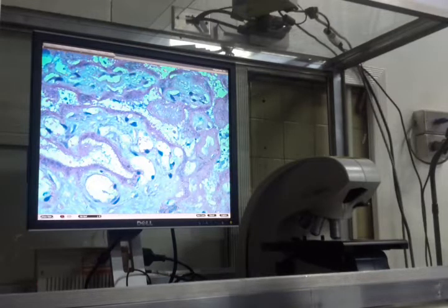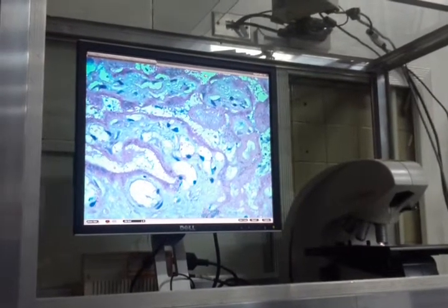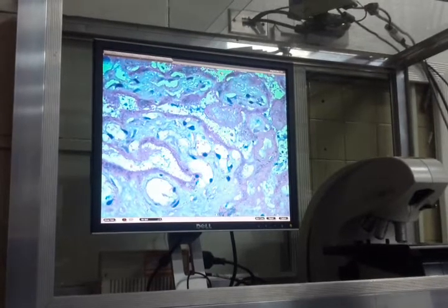Okay, what other thing can be asked of this? Bakit nagkakaganto sa placenta? Anong tawag mo sa lesion na to? Sa gross lesion. Maputi siya. White?